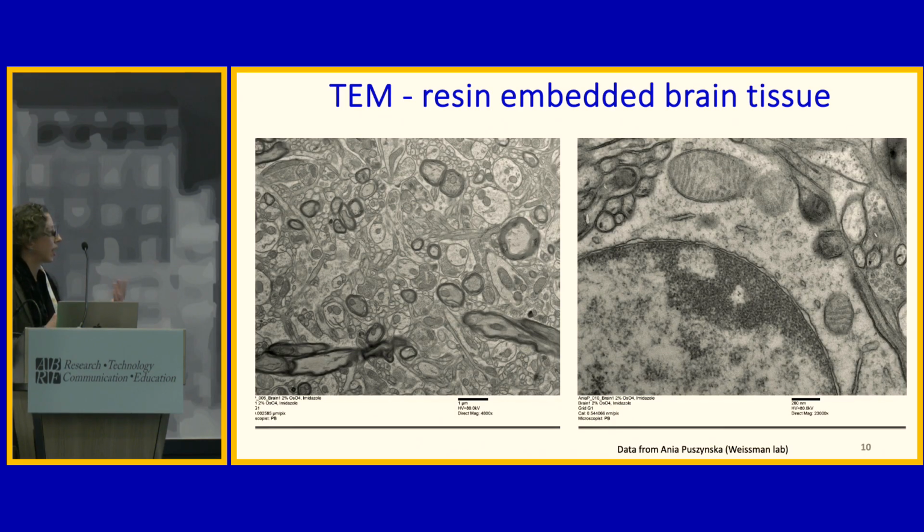This is more of the kinds of imaging that you would expect of tissue samples, this being brain tissue. And for some research, this is the answer. This is what they need to answer the questions they're asking. This is a 2D image. It's like taking a single slice out of an entire loaf of bread. But for some of our community, they actually want to image what does that entire loaf of bread look like.